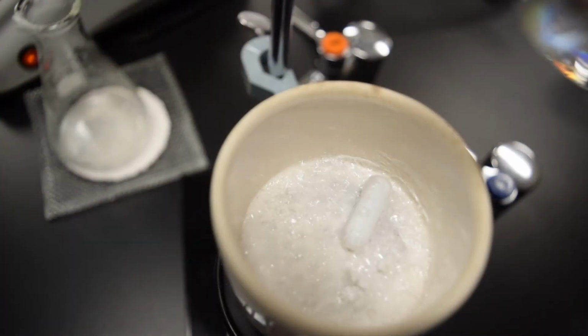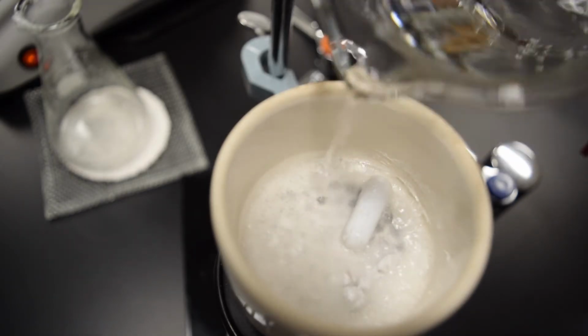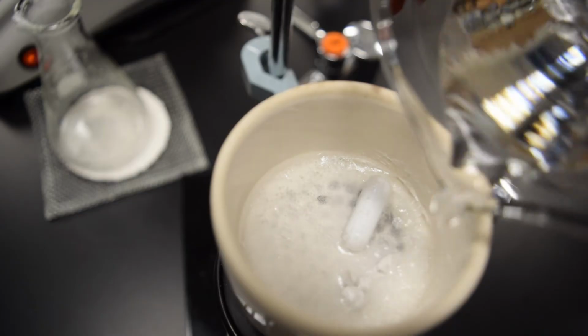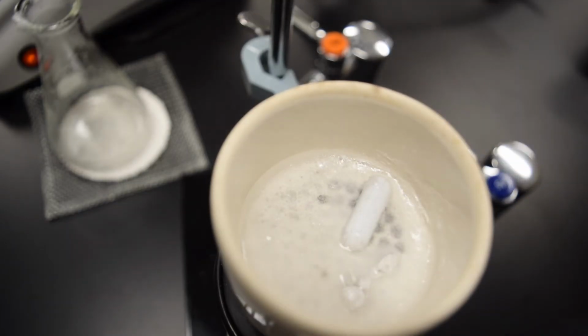You can see here that even with the hot filter paper, some benzoic acid crystals formed on the filter paper. I'll run some hot water through the funnel and you'll see that the crystals redissolve.